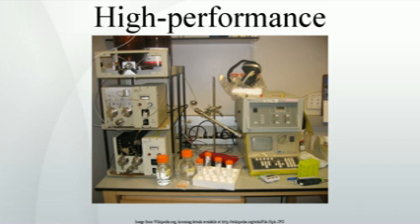Gradient elution decreases the retention of the later eluting components so that they elute faster, giving narrower, and taller, peaks for most components. This also improves the peak shape for tailing peaks, as the increasing concentration of the organic eluent pushes the tailing part of a peak forward. This also increases the peak height, the peak looks sharper, which is important in trace analysis. The gradient program may include sudden step increases in the percentage of the organic component, or different slopes at different times, all according to the desire for optimum separation in minimum time.